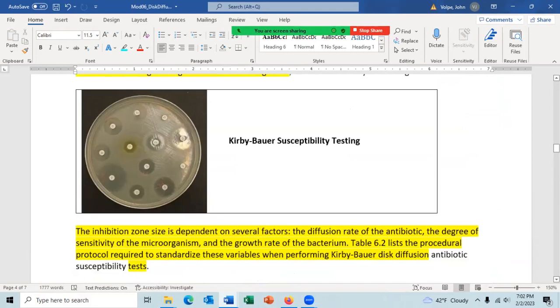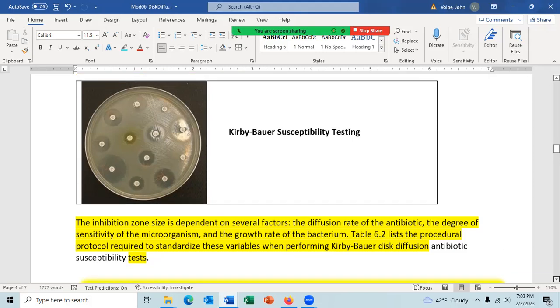And if you have a special tool, you can just put all of the antibiotic discs on the plate at one time, meaning it's something that has a lever and you push it down and it puts down all of the antibiotic discs all at one time, scattering them around the plate. And then it comes up and you remove it from the plate and you put on the lid. And then you let that sit just for a few minutes. And then you turn the plate upside down and put it in the incubator.